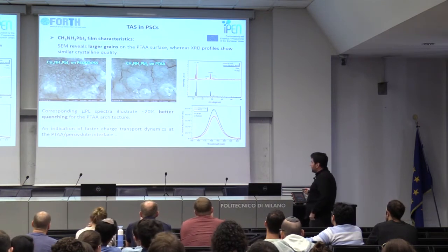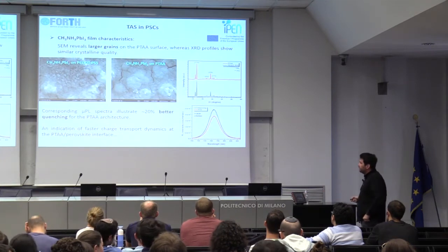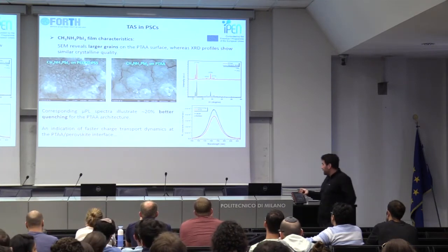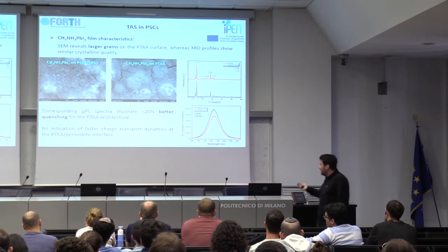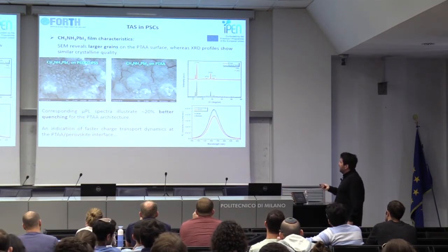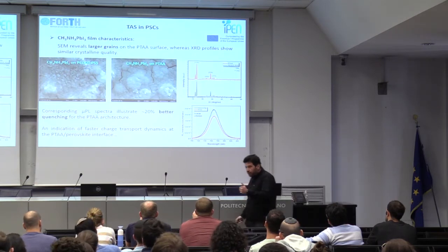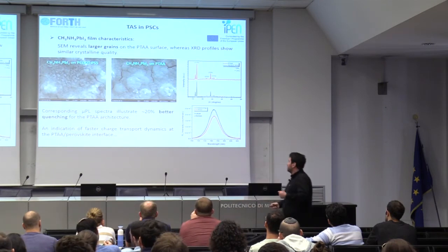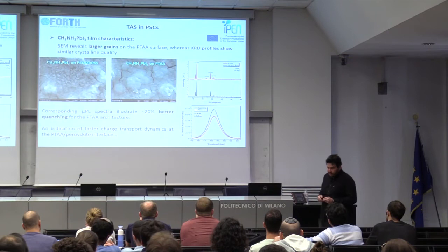And as the first evidence for this, we also measured the photoluminescence intensity of these two films by applying the micro-PL technique, and we can see that the film on the PTAA surface has a 20% better quenching than the one on the PEDOT surface. So this is the first indication that we will have faster charge extraction and transport dynamics in the PTAA methylammonium lead iodide configuration.